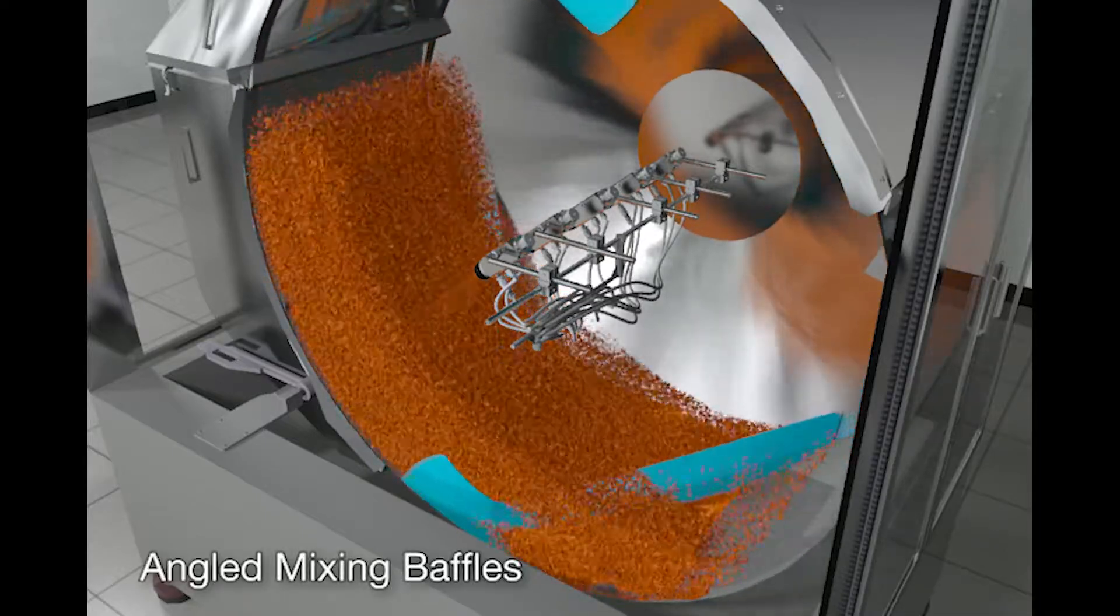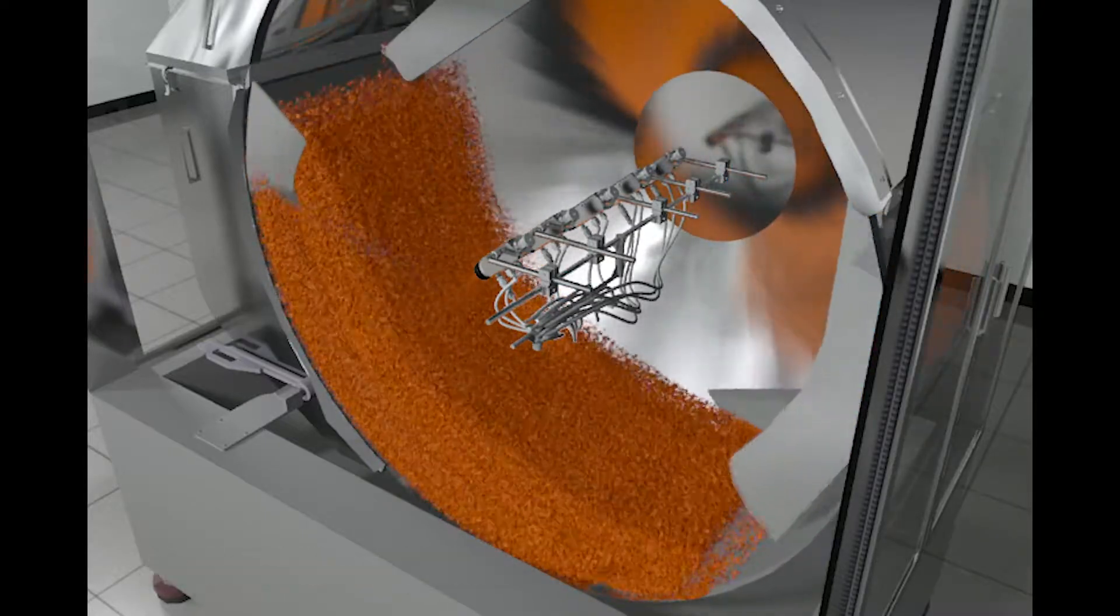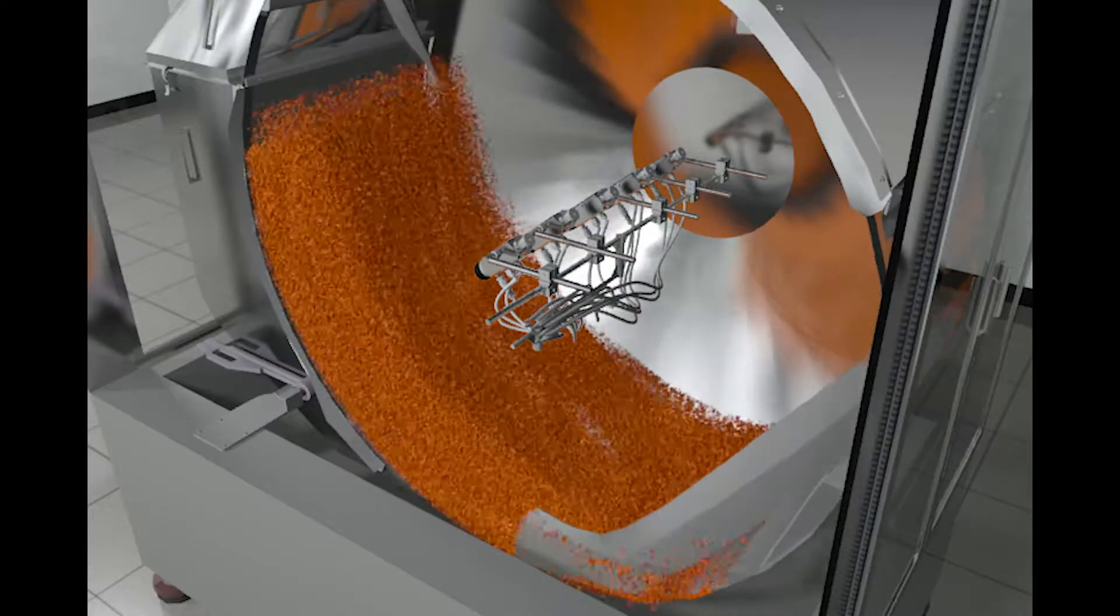Angled mixing baffles and airflow inside the drum provide consistent and effective tablet movement for uniform coating.